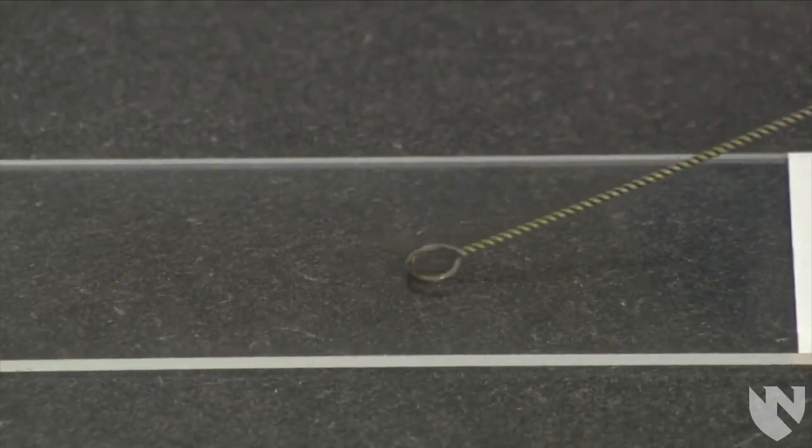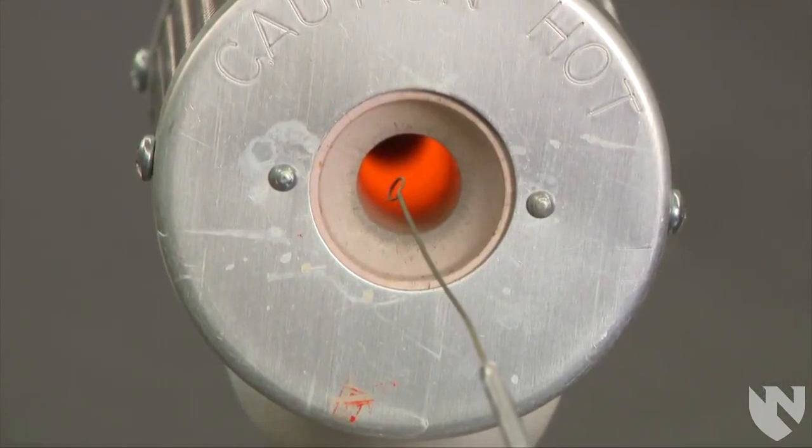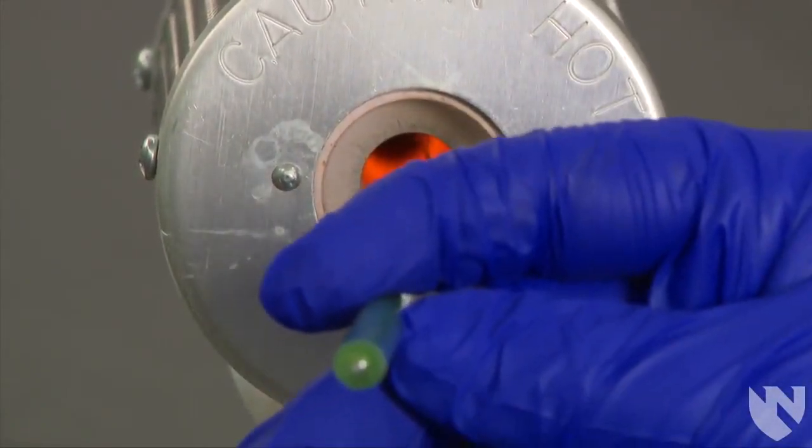Smear the colony on a small area of the clean microscope slide. Sterilize the loop or discard the wooden stick in the biohazard trash.